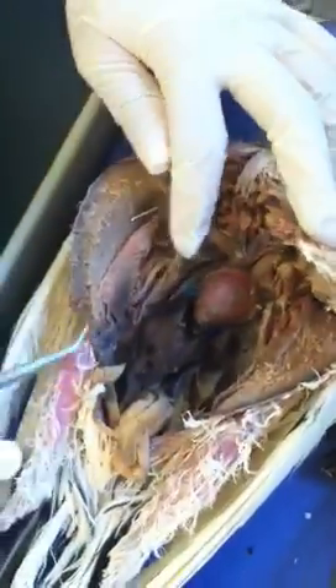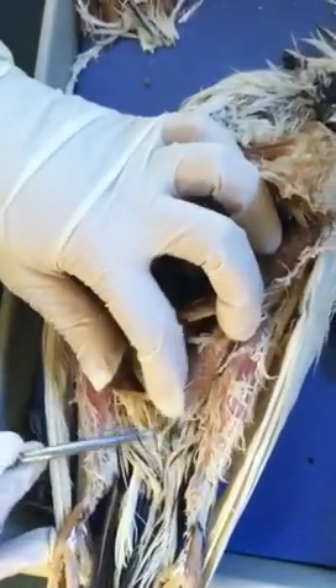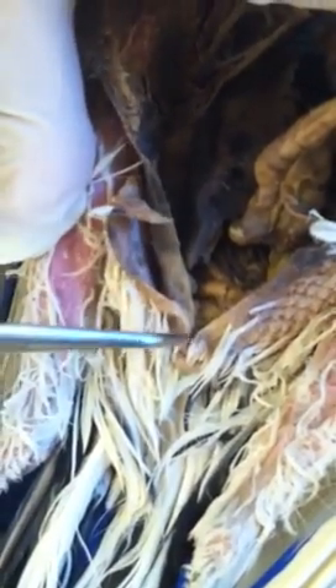One last structure — here is what would be the anus, but in birds it's not called anus, it's called the cloaca. The reproductive tract and digestive tract both share the same opening, which is why we call it the cloaca. That's the dissection — thanks!